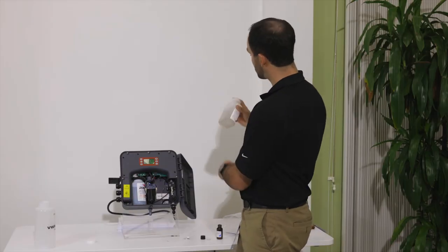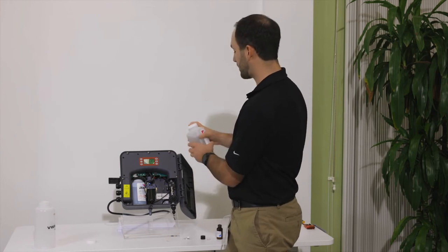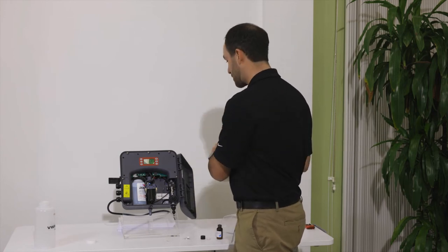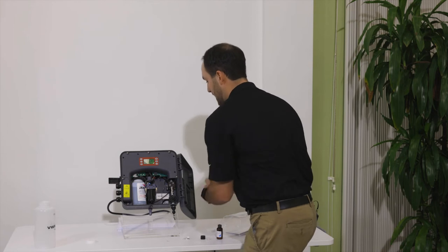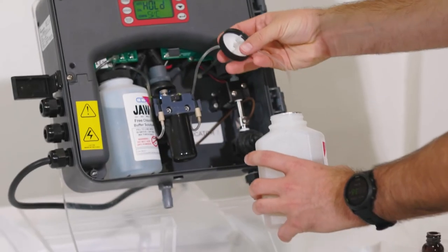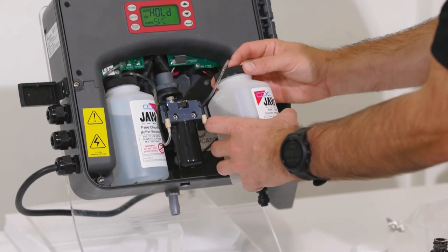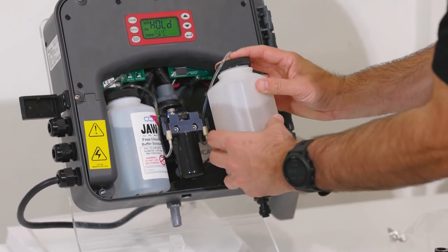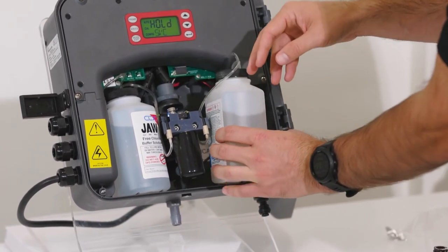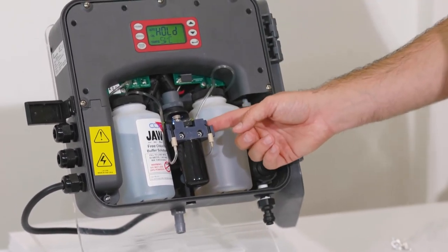Perfect. While we do that, we'll come back. We'll check our indicator. There's no chunks in the bottom, so we're good to go. Same thing. Put the line inside and hold the cap. Twist the bottle into the cap. And again, make sure that line is there.